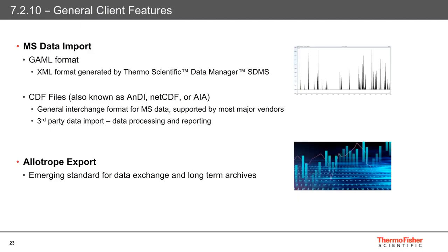Chameleon version 7.2.10 has new options for importing mass spectrometry data from external applications. When importing data from either of the following two file formats, if the contents include mass spec data, then this will be included in the import process. The format GAML — Generalized Analytical Markup Language — allows XML data generated by the Thermo Scientific data manager SDMS to be incorporated. CDF files, known as ANDI, NetCDF, or AIA, which are the general interchange formats supported by most major vendors, allow third-party data import, increasing functionality for data processing and reporting. Allotrope Data Format (ADF) has also been included in the list of available export file types, as an emerging standard for universal data exchange and long-term data storage in archives.